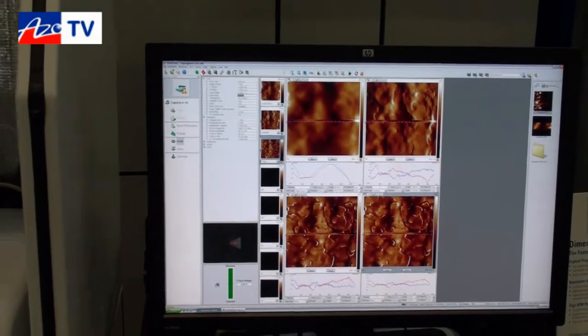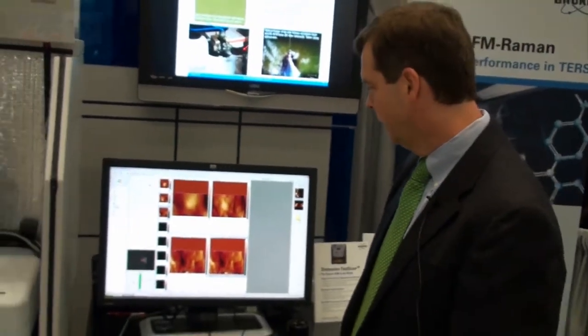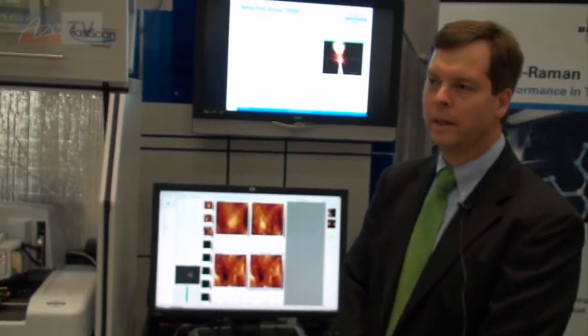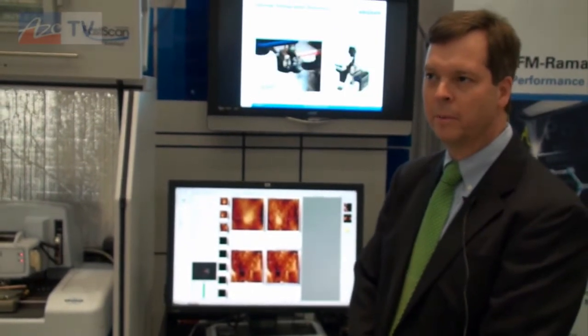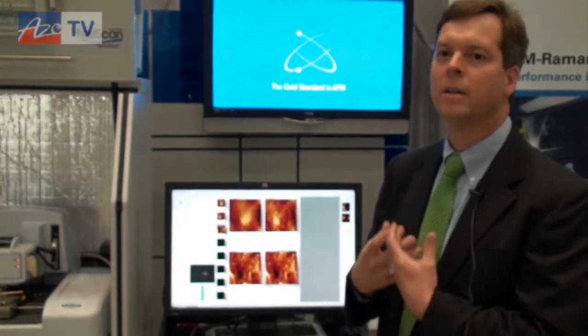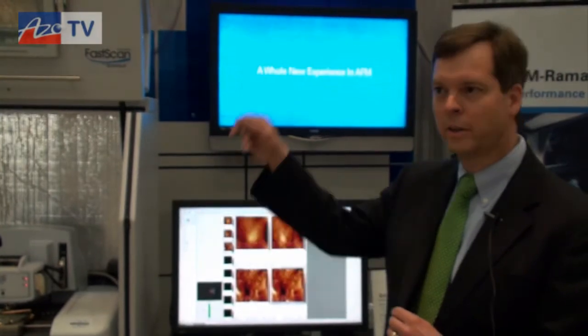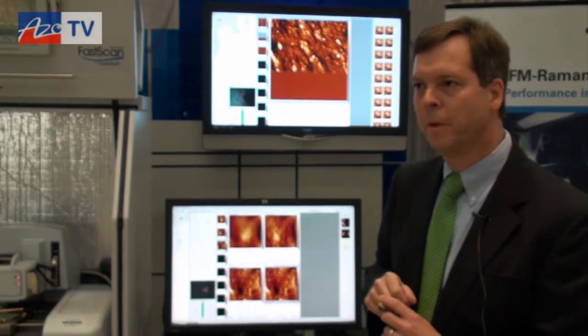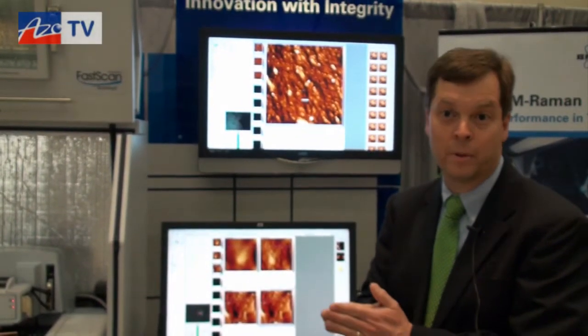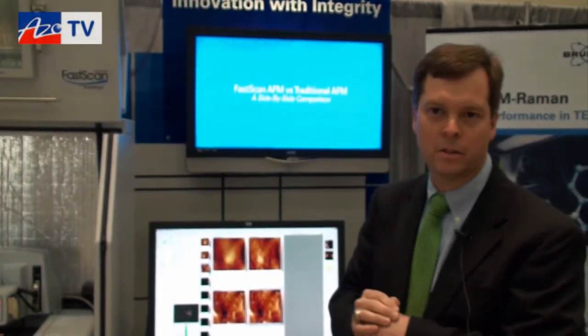You can go up to 100 times faster. One of the primary design criteria was that we wanted to scan the tip — we didn't want the sample to be moving, because if you scan the sample you increase or change your mass, which can affect the resonant frequency of the scanner and how fast you can go. We wanted to be independent and able to put wafers on here. We can automate this tool — you can have a wafer set up to image at several different sites and simply let it go. You can also set it up with a mode called peak force, where it will adjust all the parameters for you, so all the parameter adjusting I've been doing is something you really wouldn't even need to do. That mode will go about six times faster, though it's a slightly slower mode by the nature of the mode.